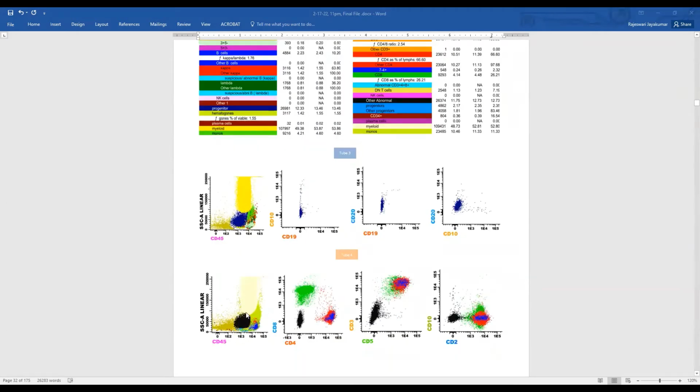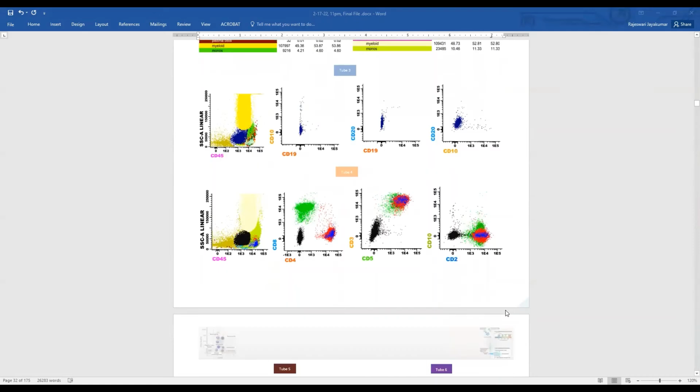And in the T cell tube, these are painted black, and they're negative for CD4 and 8, negative for surface CD3 and CD5, negative for CD2. So again, nothing that hints towards T cell lineage. We already saw in tube 1 that they are negative for CD7 also.